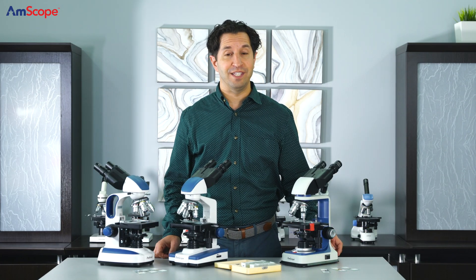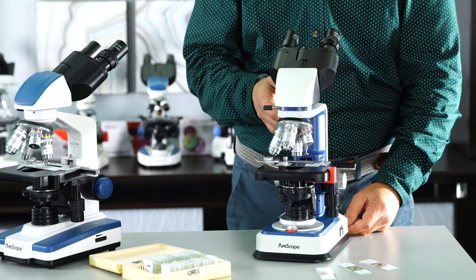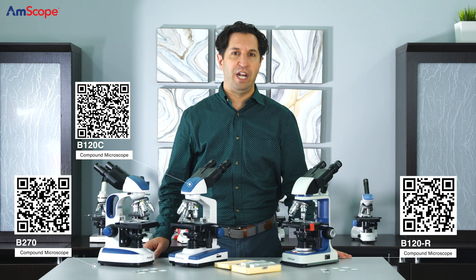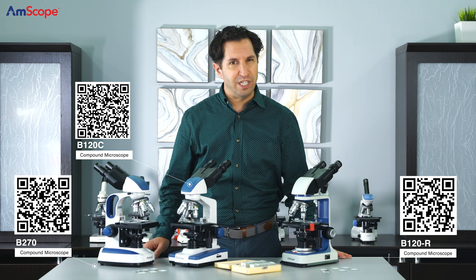Or explore the microscopic world of bugs by looking at a butterfly wing or a compound eye under magnification. Why not dive into photosynthesis? The B120, B270, and new rechargeable B120-R are perfect for high school labs looking for a versatile compound microscope.